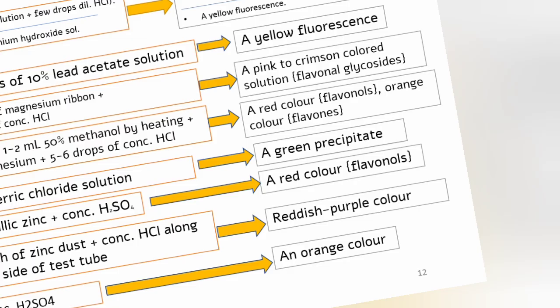Flavonoids are considered one of the important classes of secondary metabolites present in plant extracts. Examples of flavonoids are naringin and quercetin, which are present in the peel of citrus fruits such as orange and grapefruit. Flavonoids have various pharmacological functions. There are 8 qualitative chemical tests used for detection of the presence of flavonoids in plant extract.